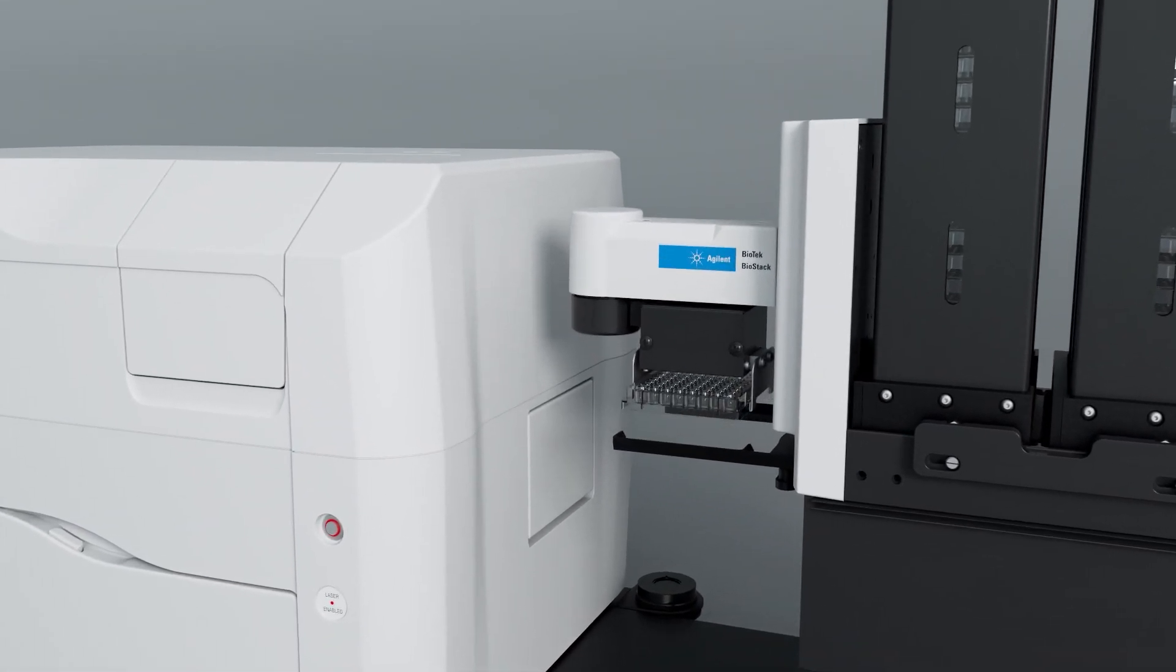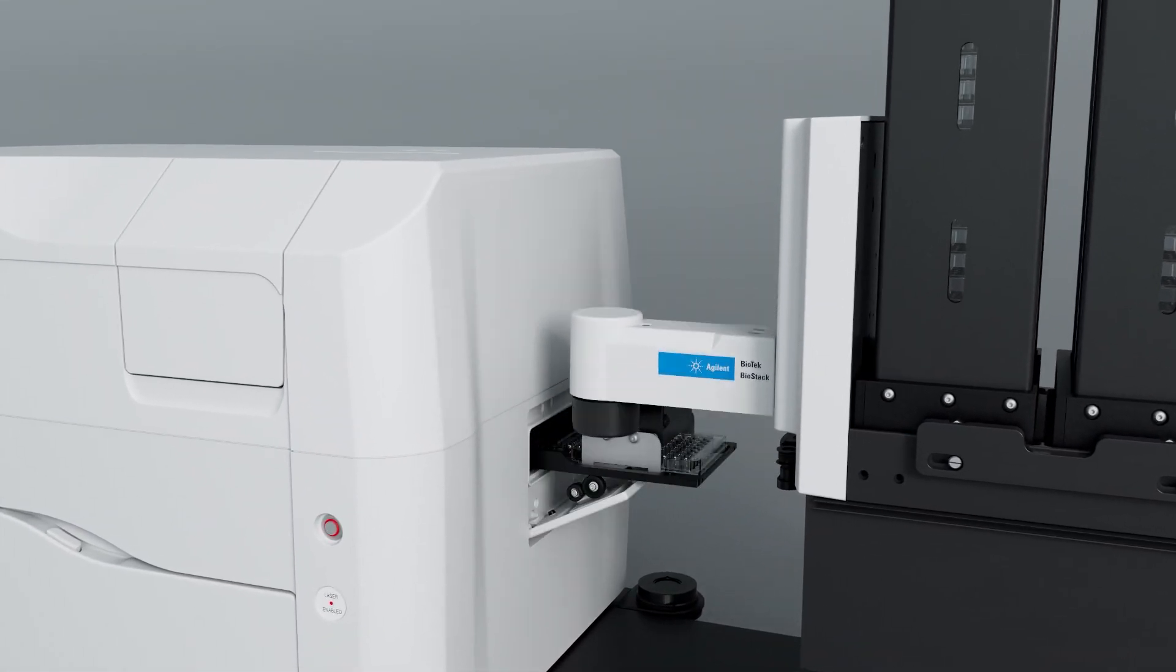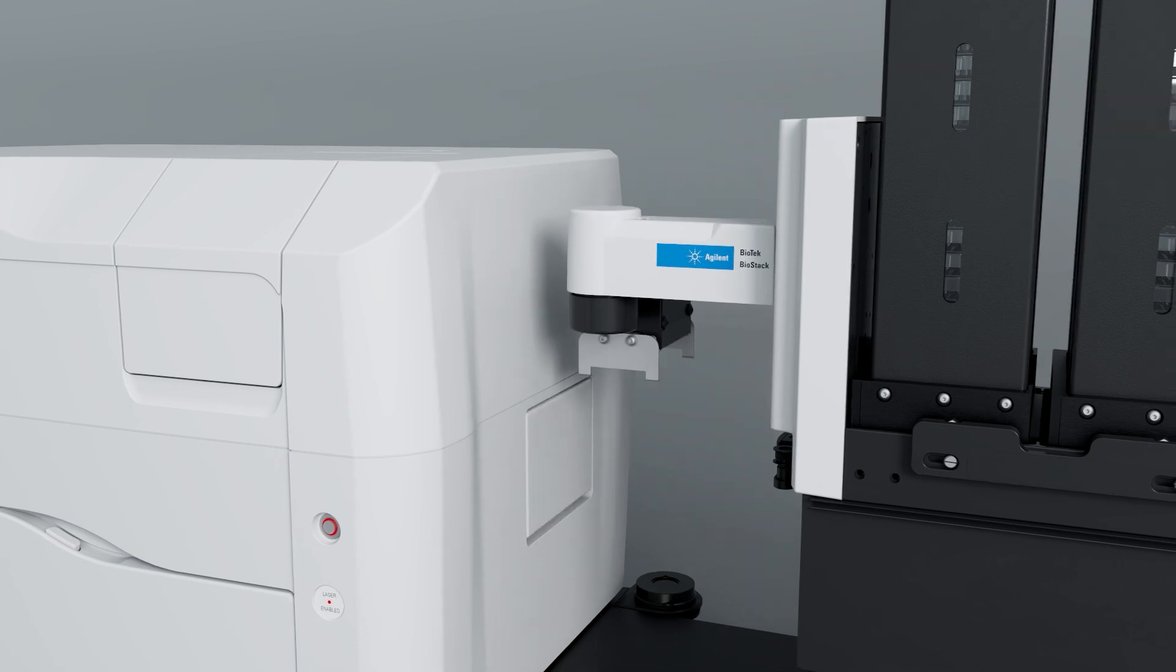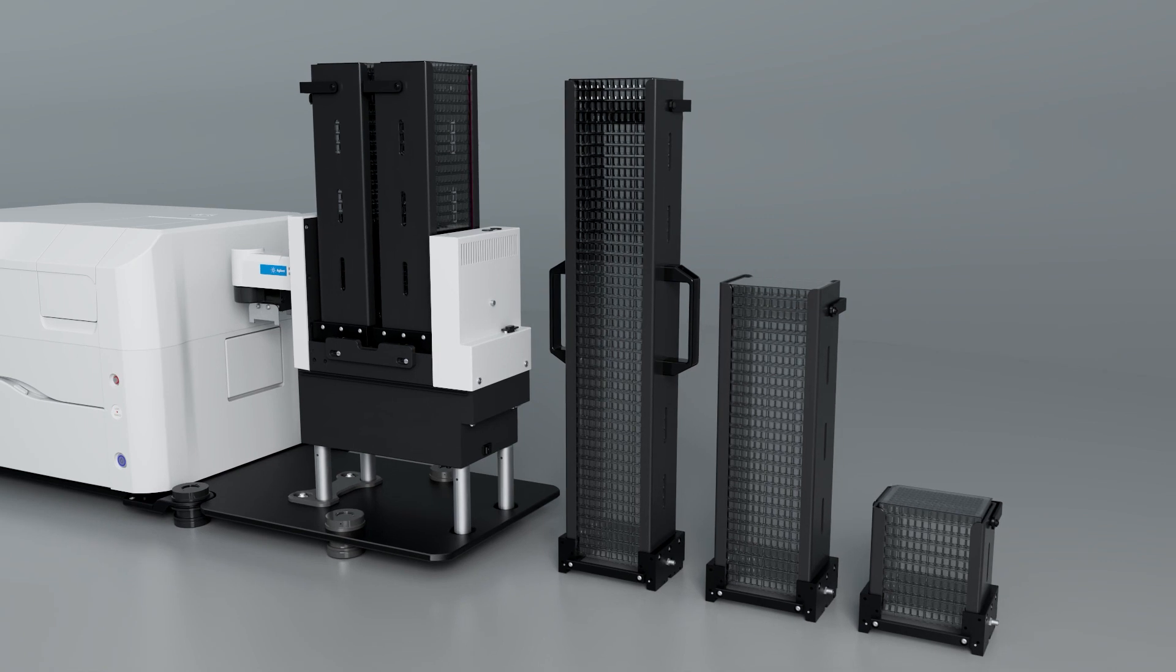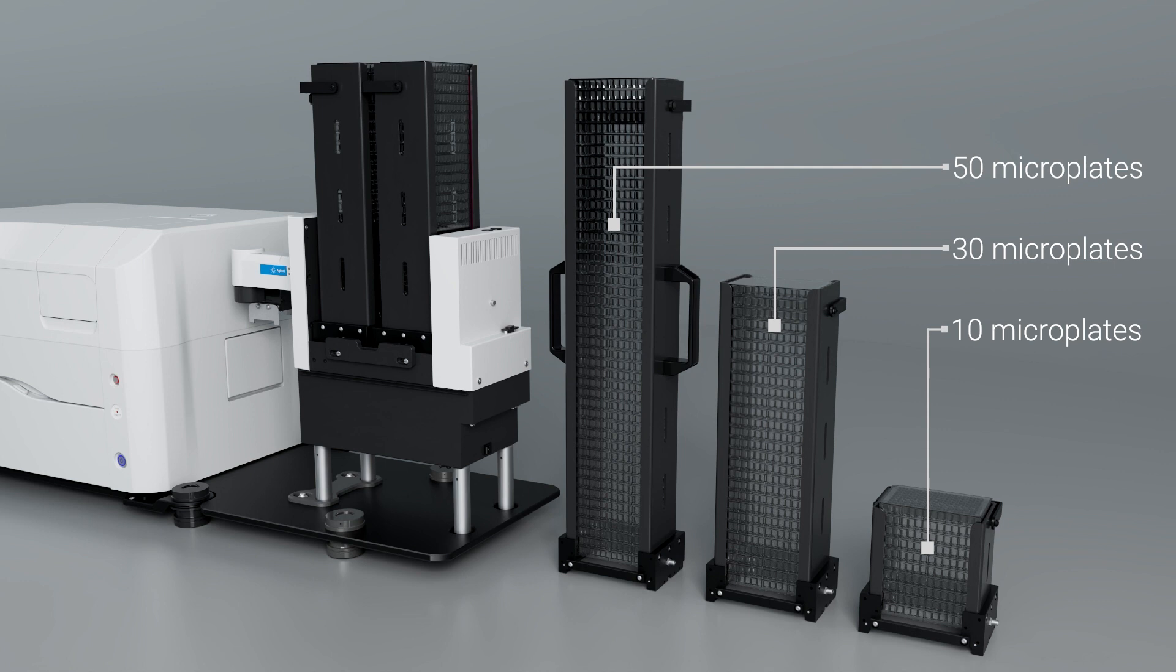The BioStack enables automatic movement of samples in Microplates ranging from 24 to 1536-well format in addition to slide holders. 10, 30, and 50 plate stacks can be used with the BioStack and can be interchanged from stacker to stacker.